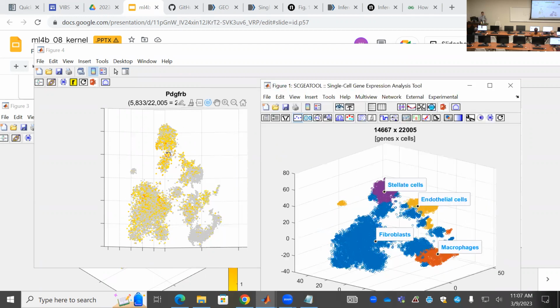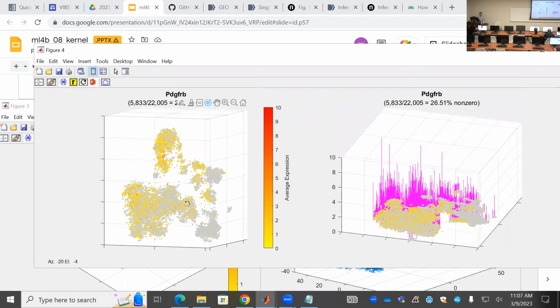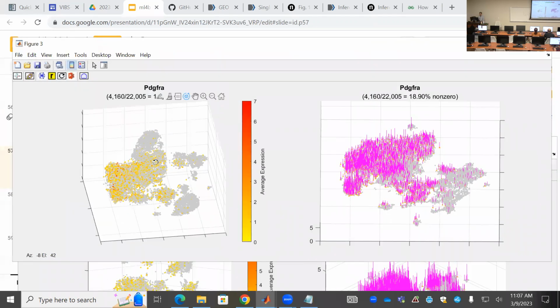So by visualization, we create some kind of link between endothelium cell highly expressing CAV1 and this receptor being highly expressed relatively in stellate cell. So that's why this communication relationship was established. The receptor A is not so clear.